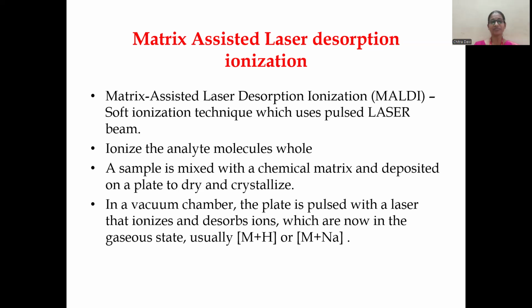So what is happening here is that the plate will be coated, deposited, dried and crystallized. Then on this plate, we will be applying a laser.